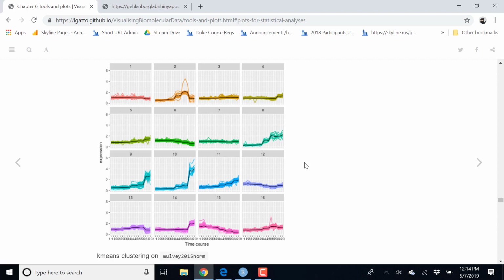And very often when these methods identify the number of clusters automatically, they become rather advanced. There is specific modeling that happens behind the scenes with Bayesian statistics that are implemented for that very specific problem, and then they might estimate these values automatically.